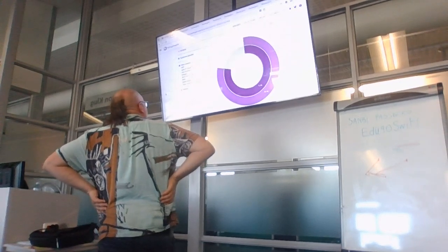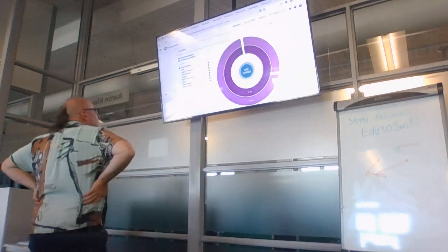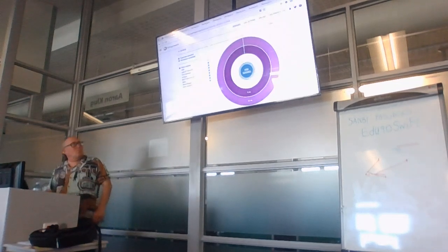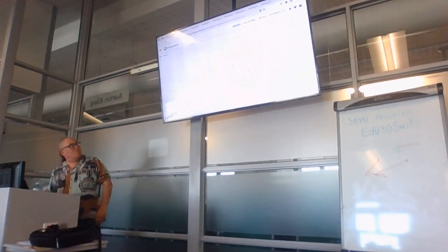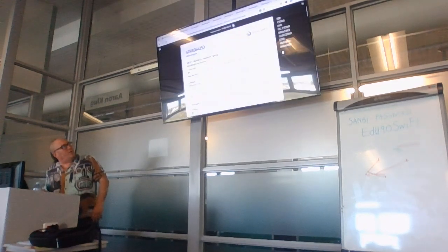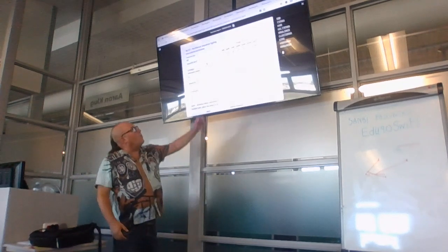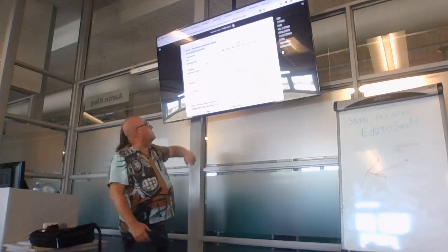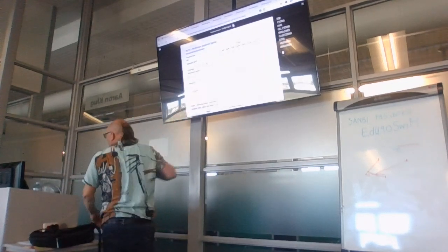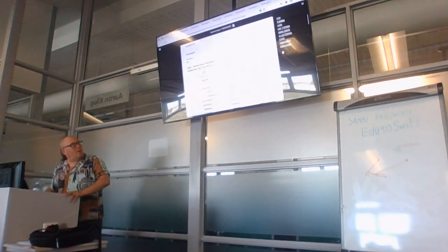Just wait for it to finish the last analysis. Okay, analysis complete. Now I can view the genomes, and I can look at a report for each genome, and it can tell me what the MLST profile is there. The serogroup is O1. Cholera O1.